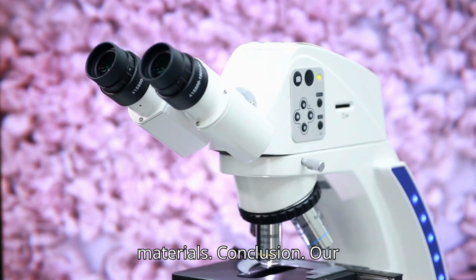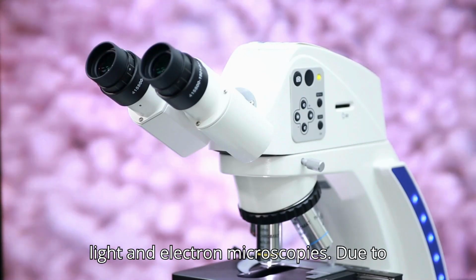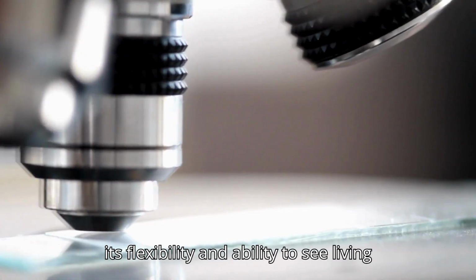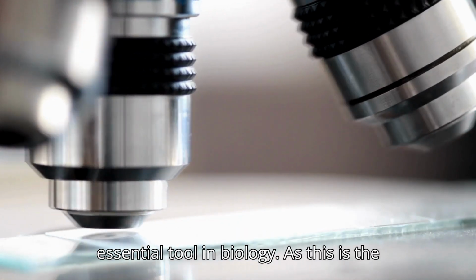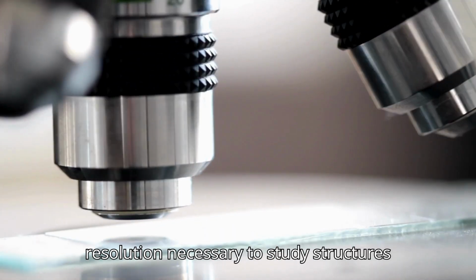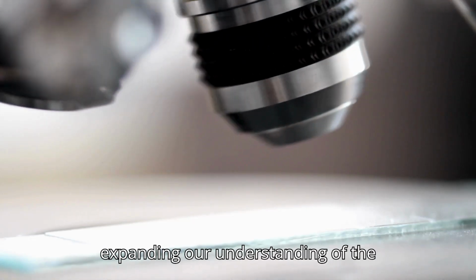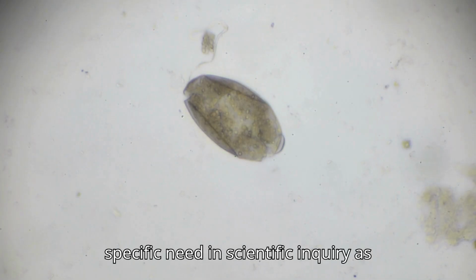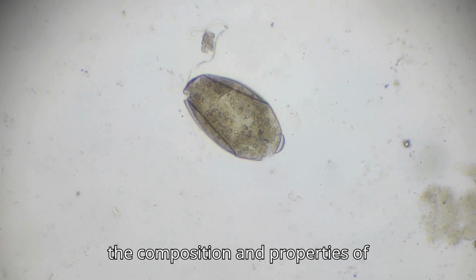Conclusion: our understanding of the microscopic world has been totally revolutionized by both light and electron microscopies. Due to its flexibility and ability to see living cells, light microscopy remains an essential tool in biology. Electron microscopy provides the resolution necessary to study structures at the molecular level, thus greatly expanding our understanding of the natural world. Both fulfill a specific need in scientific inquiry as they give a contrasting view regarding the composition and properties of materials and living things.